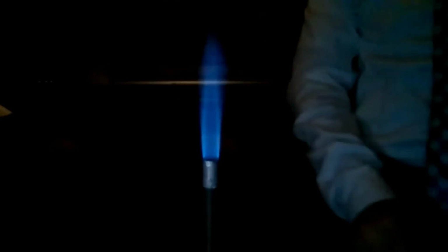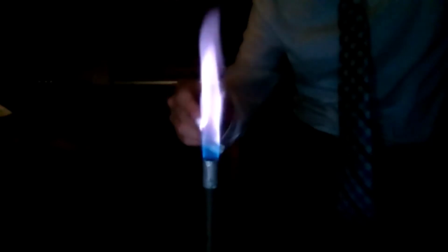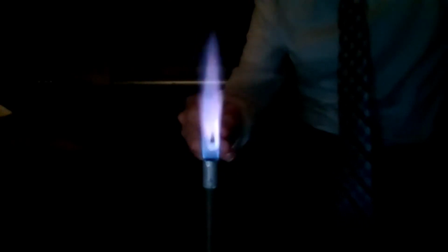So the first one we're going to do is potassium. Go ahead and find potassium on that sheet. It's K. And we're going to see what color potassium burns. Do you guys see that? Pretty cool, right?